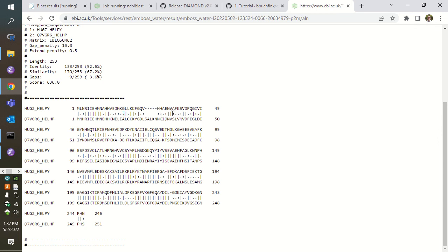Some of these are a little stronger, though. Alanine and serine tend to be a little stronger in their association with each other over evolutionary time. S and N, more similar to each other. Glutamine and glutamate, relatively similar to each other. Of course, isoleucine and leucine are a pretty strong match for each other. Those are all given double dots.